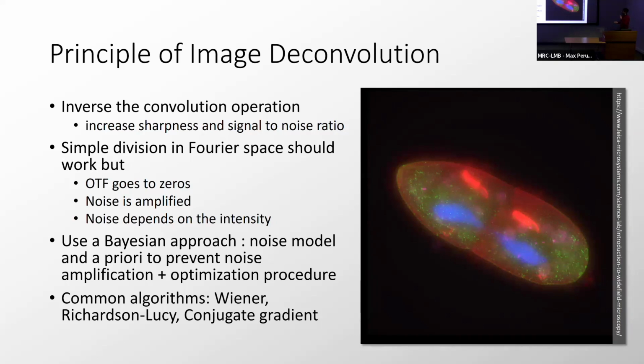From this setting, if you assume a Gaussian noise instead of a Poisson noise, you would have a least squares approach, and you can derive directly a linear filter, which you can apply in one step. This filter is what you see in the software, for example, in the Zen software when you do Airyscan, or in various other situations. I think you will see this name appearing.